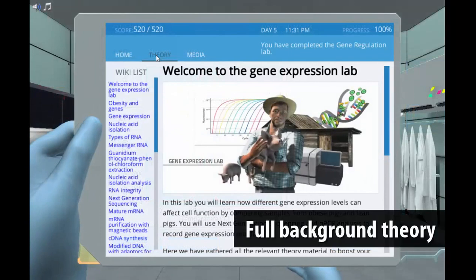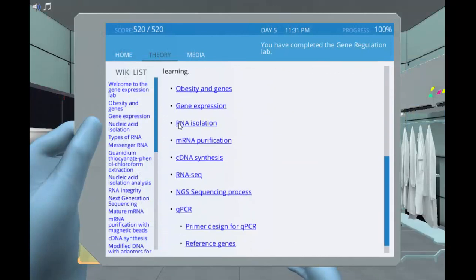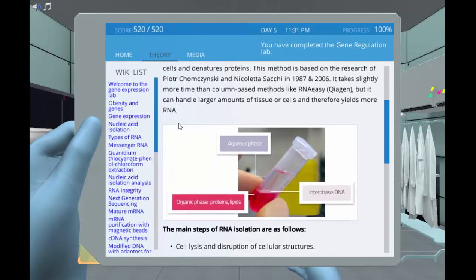Besides the core lab, Labster provides a full theory section which provides the student with relevant background information when needed.